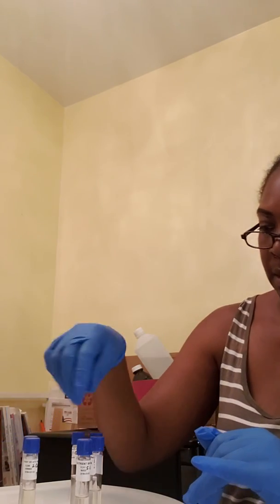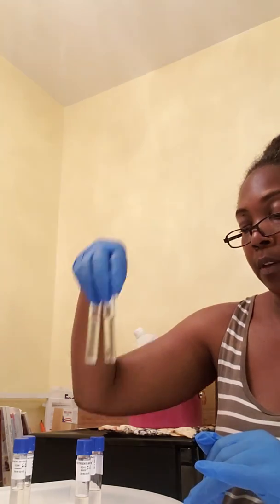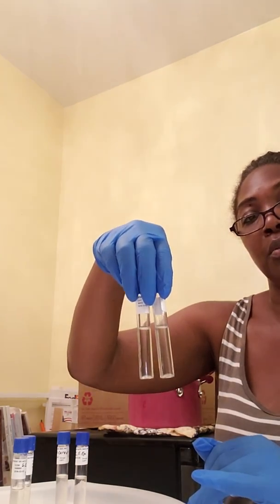Okay? And so that would conclude my lab exercise regarding environmental influences on microbial growth with salt tolerance testing. With the 6 tubes here, nutrient broth with sodium chloride at different concentration levels: 1%, which showed a little bit of turbidity; 7%, which was pretty ideal, I would say the most growth of microbes; and then 15%, which basically showed no growth.